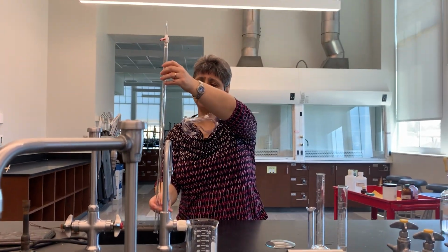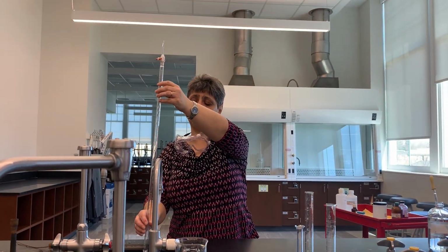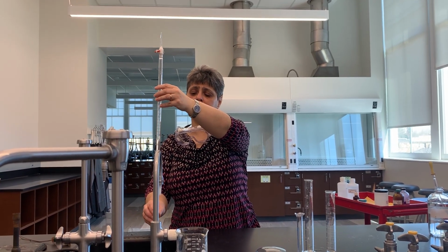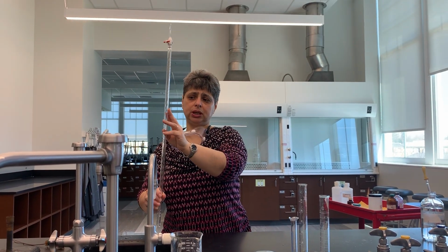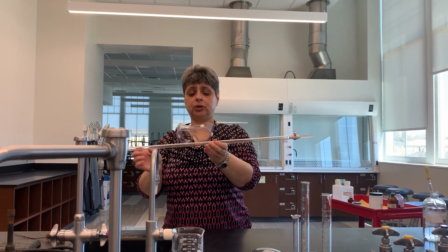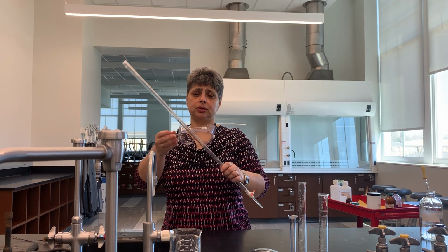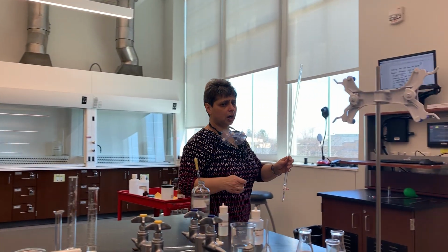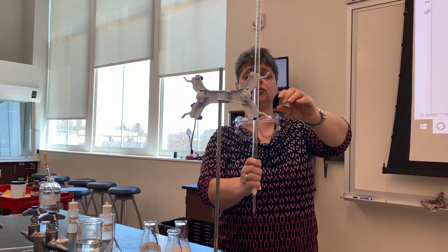Typically burette is washed at least 2 or 3 times with deionized water, and then a couple more times with a solution that will eventually be used in the burette. In our case it's sodium hydroxide. I'm not going to show you washing with sodium hydroxide simply to save time. Instead, I'd like to show you how you would fill the burette and how you would read it.